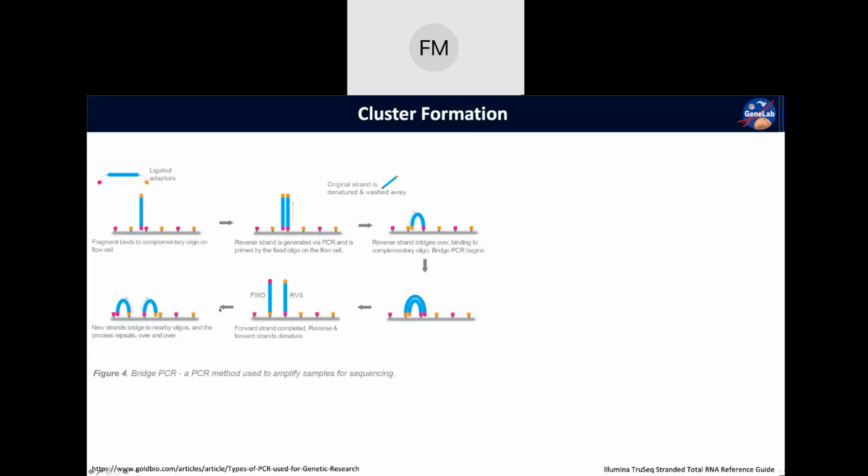Okay, so in this little cartoon here that I pulled, any pictures or images that I use, I have references to them on the slides. So when I send out these slides, you will have all that information, and I encourage you to read up more about this stuff, because it takes a while to wrap your head around. Okay, so we have our libraries, which essentially look like our region of interest with our adapters on either end. This cartoon also shows those adapters being ligated, so we're already past that step.